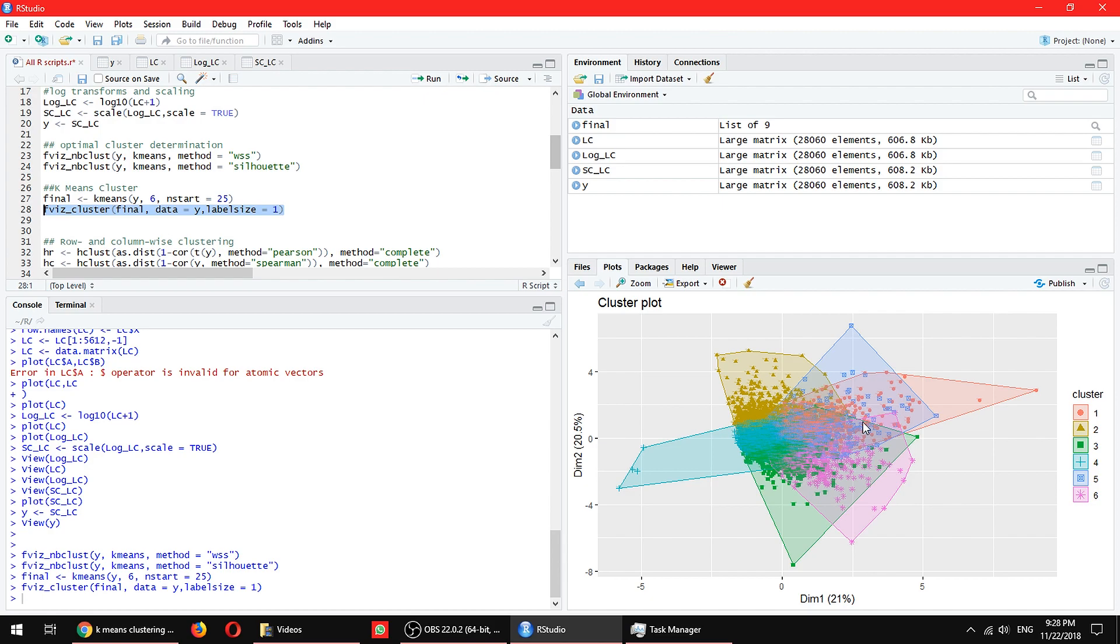You can see the different colors actually represent different clusters. Different colors represent different clusters in this. We have 6 different clusters mapped nicely on the cluster plot over here. Now we have known that there are 6 clusters. We can proceed to the heat map and the actual part of hierarchical clustering and heat map generation. I'm going to enter the second video right here.